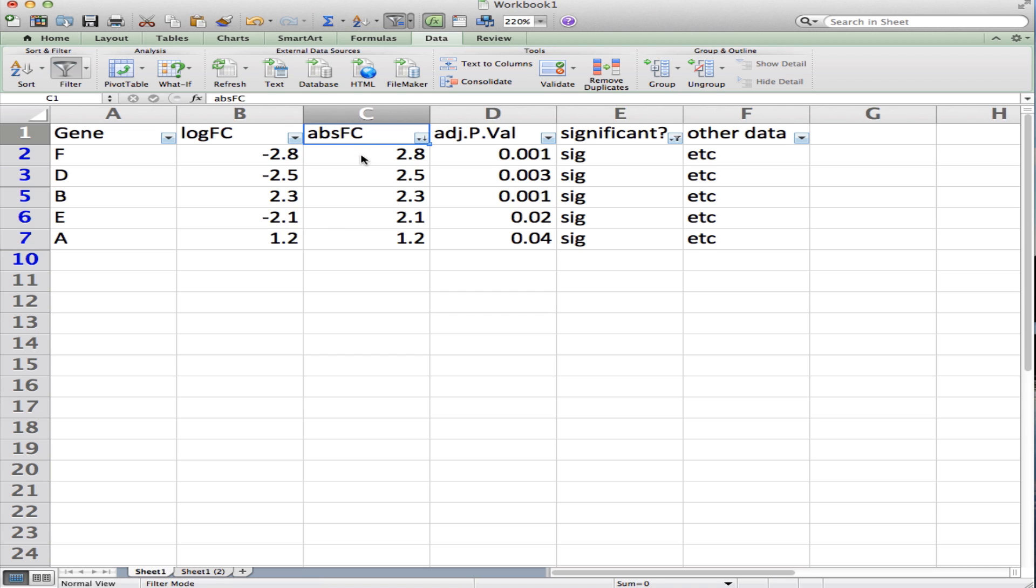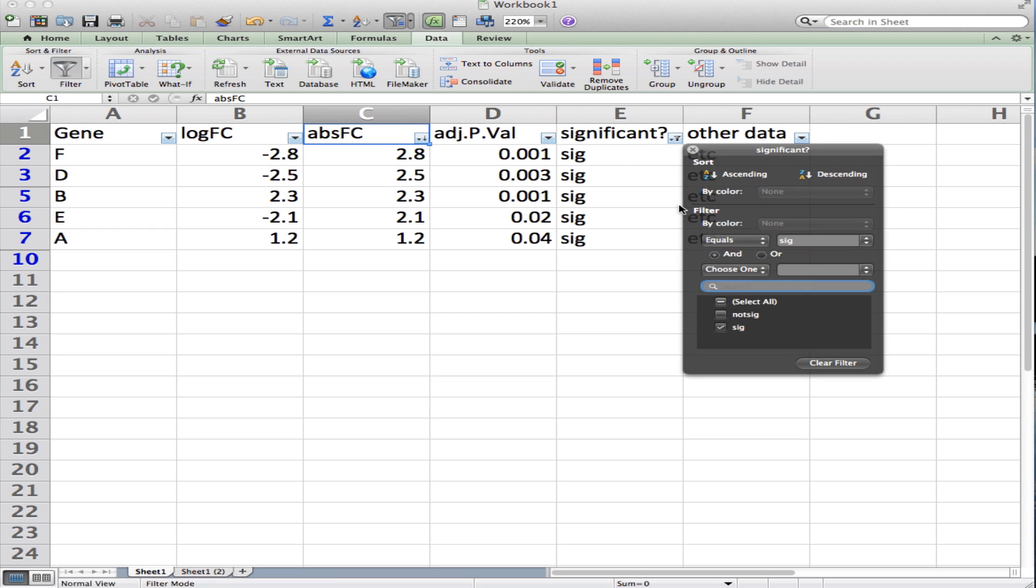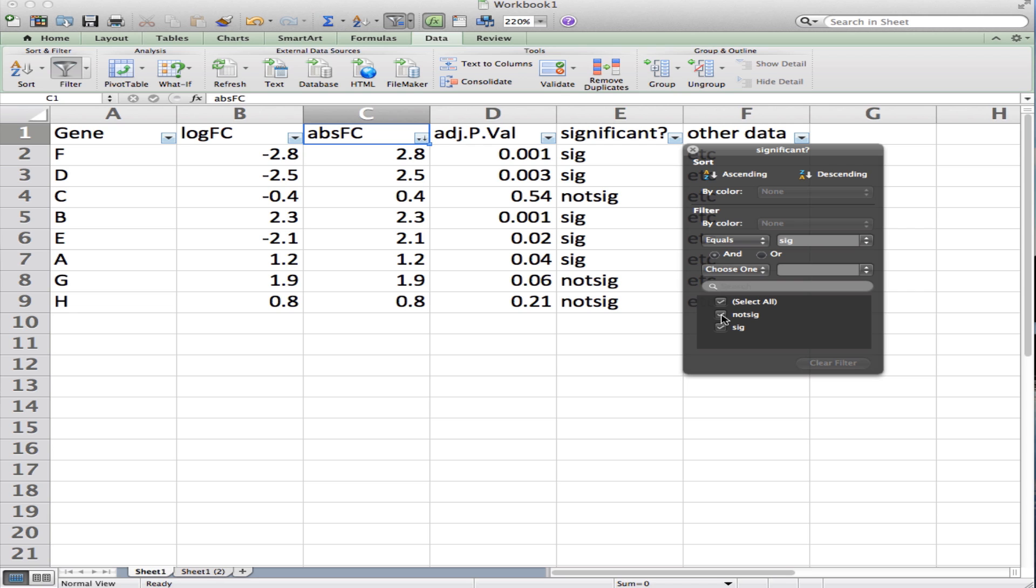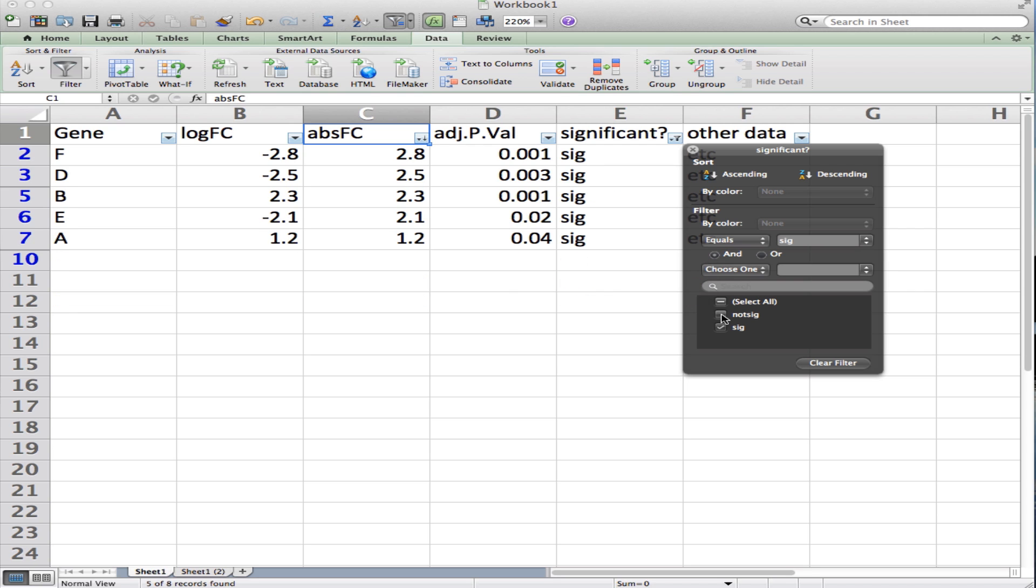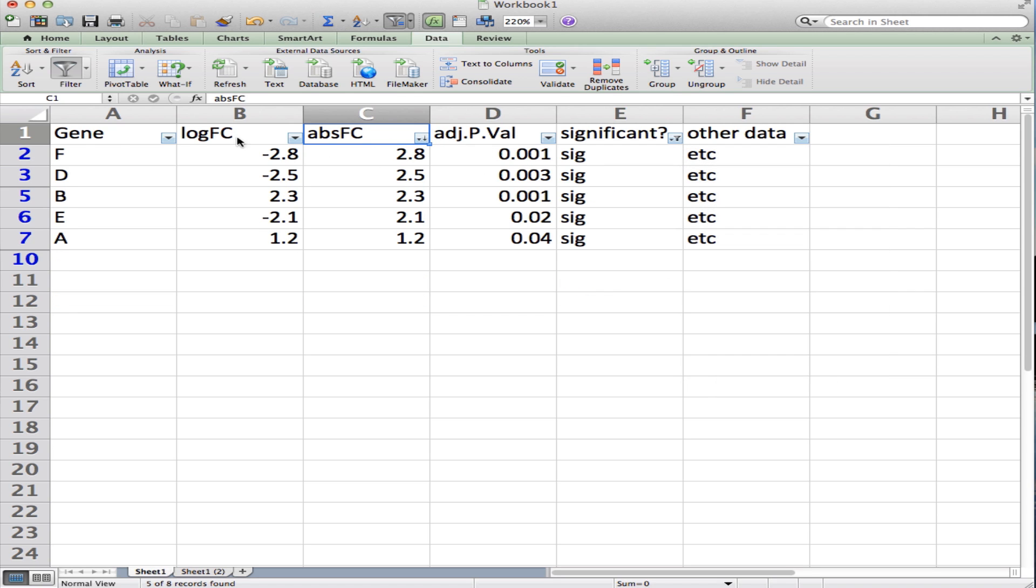Then I can turn this filter off if I want to and show all the genes and so on. So you can go through and do some filtering and sorting pretty easily this way.